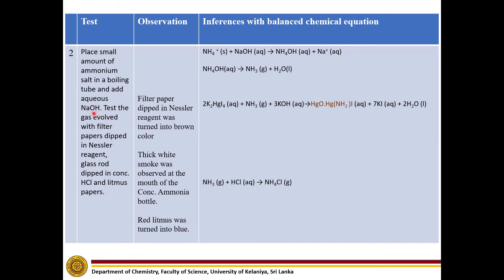When we add aqueous sodium hydroxide into ammonium salt, it evolves ammonia gas. This ammonia gas reacts with potassium mercuric iodide and potassium hydroxide present in the Nessler reagent and gives rise to this brown color precipitate.